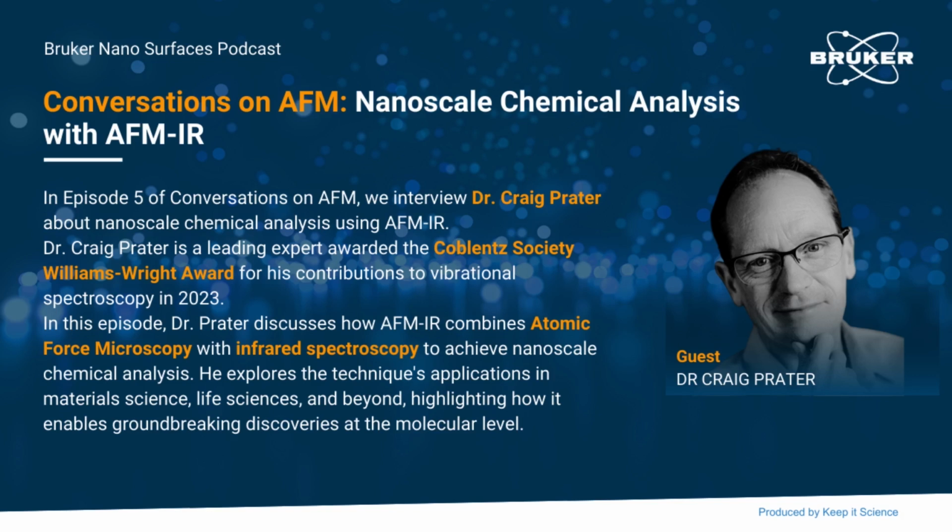Oh, I love this. Yeah, because obviously we could talk resolution all day long, but it's also so important to think about the user. And like you say, if it's like having optical concepts, it's so much easier to kind of move from a normal optical microscope more towards more advanced technology. So that's obviously really important to also keep in mind that users need to understand and be able to use the technology. And so that's really great because it also brings us to applications, because now we spoke about the kind of technology, but obviously there's a whole range of applications. And generally, AFM can be used for a wide range of applications, but we want to really focus today on AFM-IR. And so we would love to hear a bit about your top application of AFM-IR.